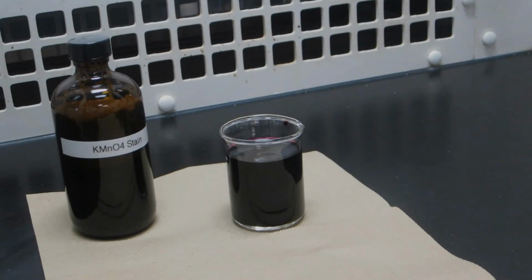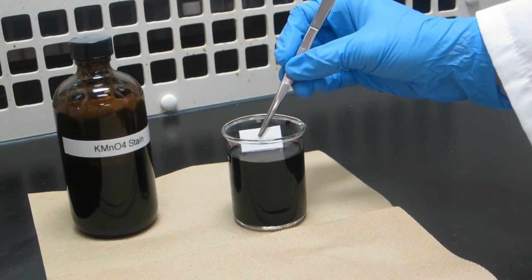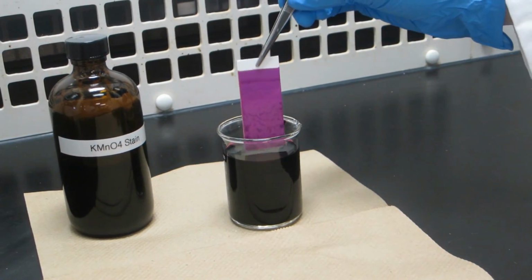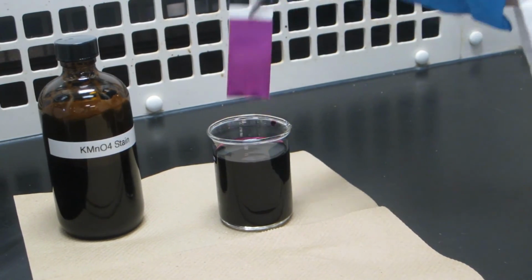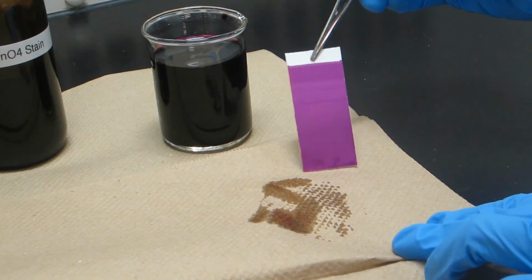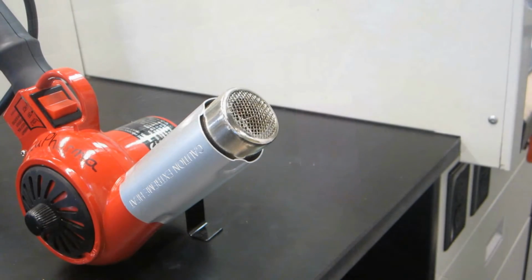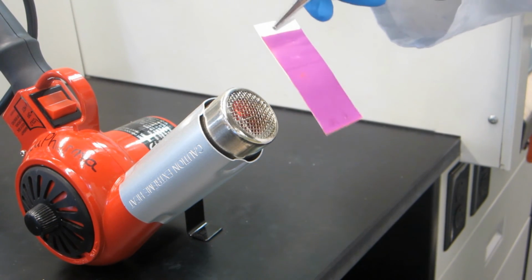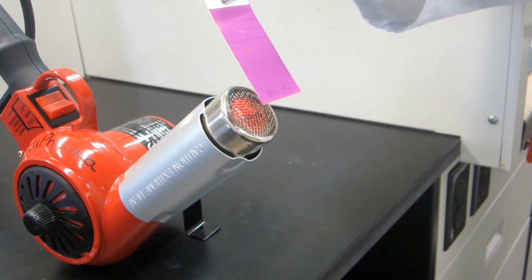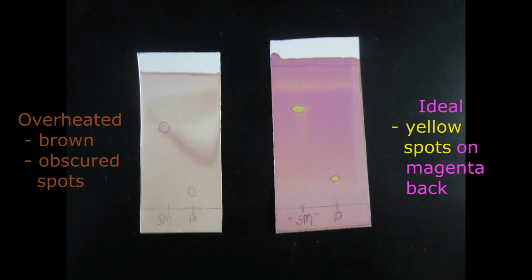An example of a chemical stain is potassium permanganate. Permanganate stains are useful for compounds which can be oxidized. Dip the plate in potassium permanganate solution using tweezers. Allow the excess solution to drip off back into the jar, and then dry the back of the plate briefly on a paper towel. The plate can be left to dry until the spots become visible. Alternatively, the process can be accelerated by gently heating the back of the plate with a heat gun until yellow spots appear. The plate should not be overheated or it will become brown and obscure the spots.